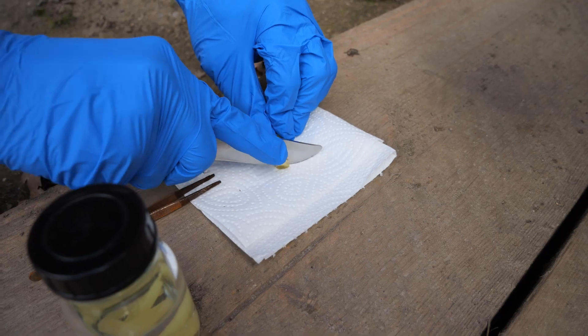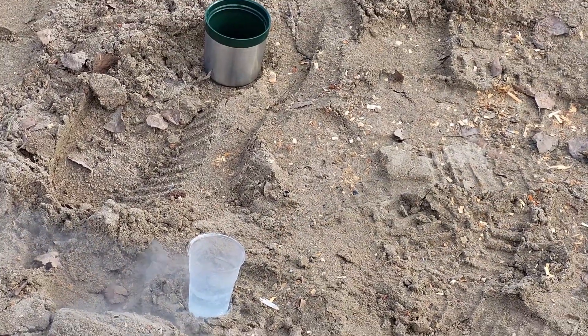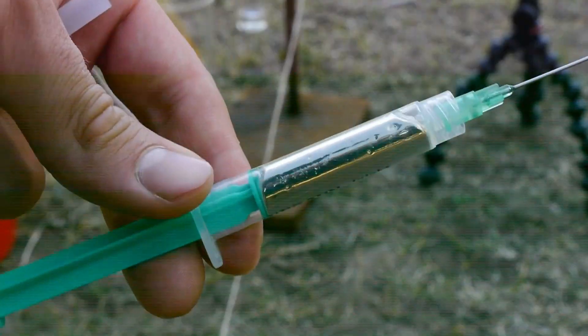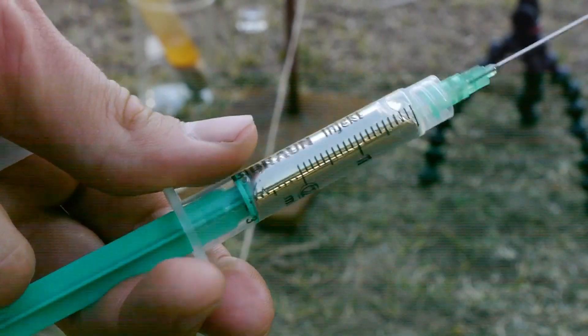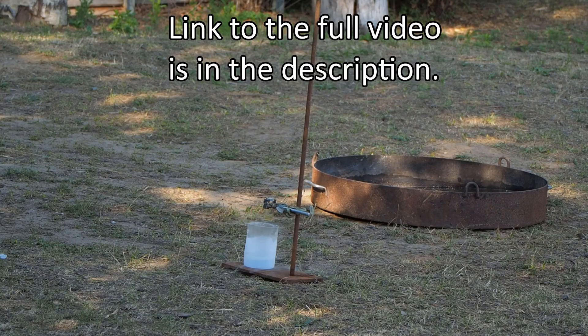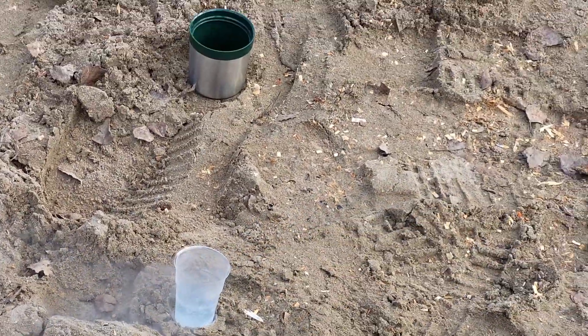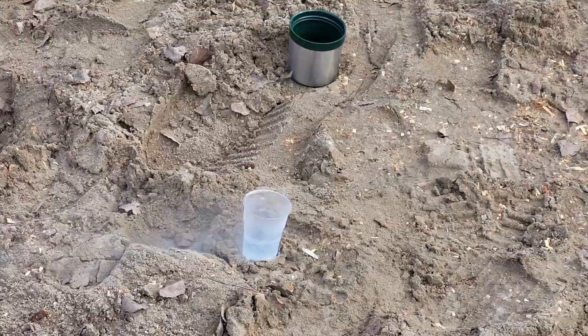To start, we cut a rather small piece of white phosphorus and dropped it into liquid oxygen to see if it reacts on contact. When mixing cesium metal, which is another element that can self-ignite in air, with liquid oxygen in another video, it blew up immediately. But for white phosphorus, sadly nothing happened — maybe because it was covered in water.